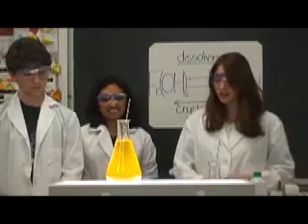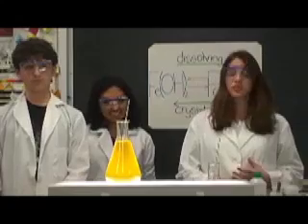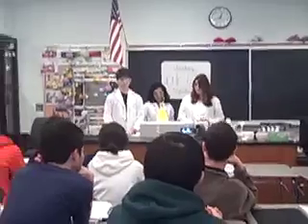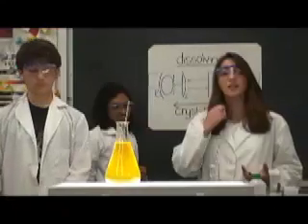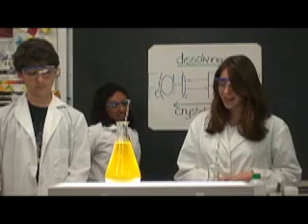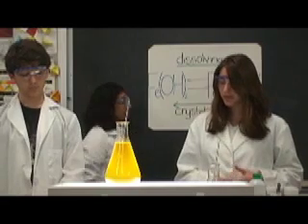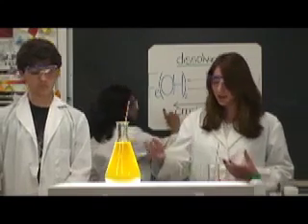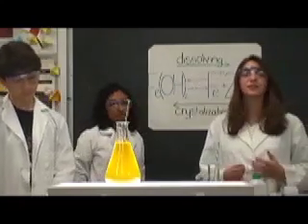When Sana added the hydrochloric acid, the hydrogen ions reacted with the hydroxide ions in the solution to form water. But these hydroxide ions were part of the equilibrium. Since there is now a lower concentration of hydroxide ions in the solution, the equilibrium shifted. Le Chatelier's principle states that if the concentration of the reactants decreases, then the system will shift to restore the equilibrium. So the precipitate dissolved in order to increase the concentration of the hydroxide ions and relieve the stress on the system.